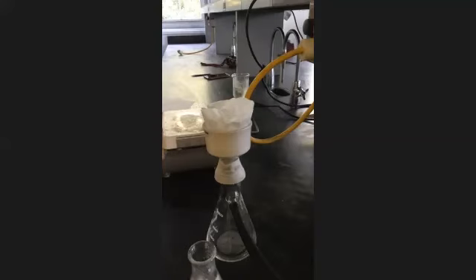20 milliliters in there, and then put it in here. Yeah, and then you'll swirl it around and pour it in. You can add that distilled water straight to the flask, swirl it around and then just pour it. And it can be more than 20, so don't worry about that part. We do it twice, because you want to get all that residue. Anything you leave behind is going to cut your yield. So you want everything that you can get.